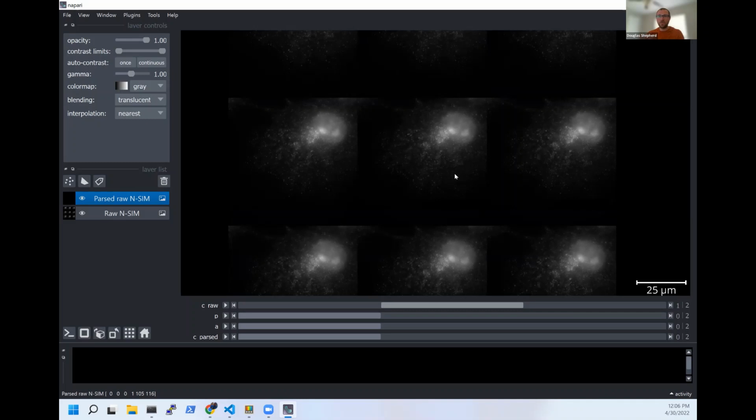If you are interested in running this on Nikon data more, I've already provided a Python file with a command line interface to a collaborator that you can use to load your Nikon data and iterate through everything. I'm happy to provide that to anybody. You just open an issue on the GitHub and we'll add it. I just don't want to clutter this workshop.